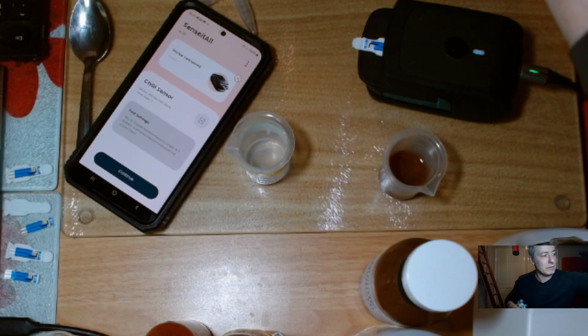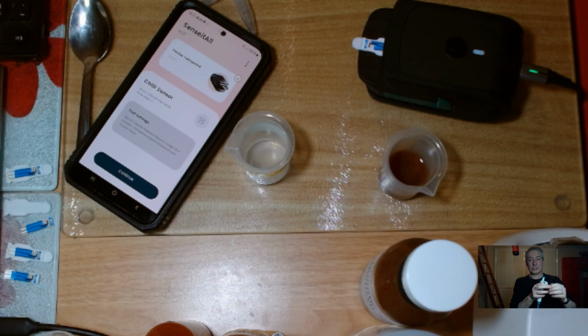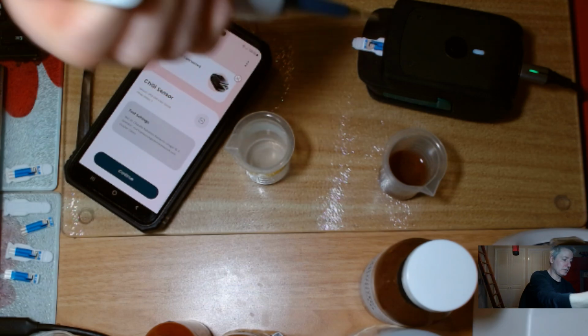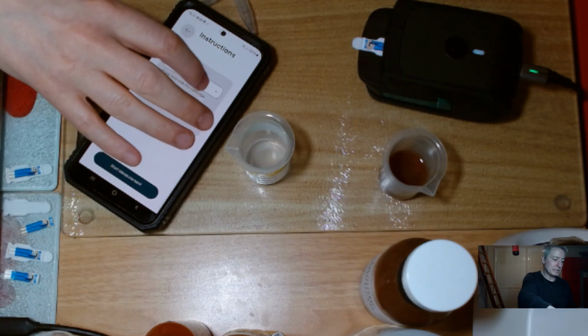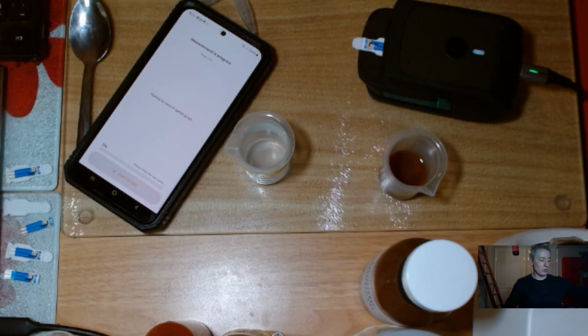I'll just vortex that up finally. 1, 2, 3, 4, 5. I just want to get that homogeneous at the end there, so that I'm testing a representative sample. Right, so I put the 50 microliters on like that. I'll continue. You saw me do a 1 in 10 dilution, so I'll make sure I choose the 10. Start measurement, and off we go.